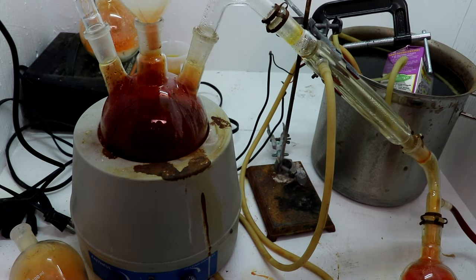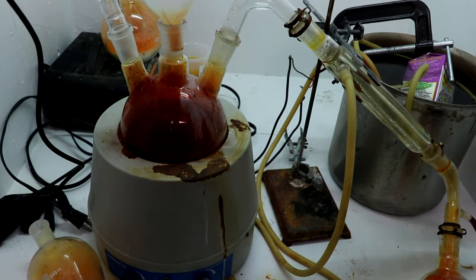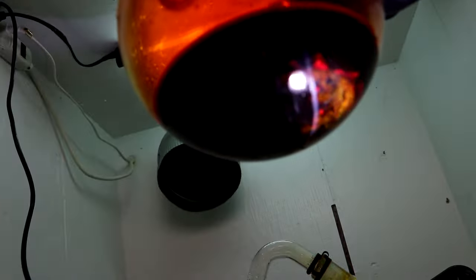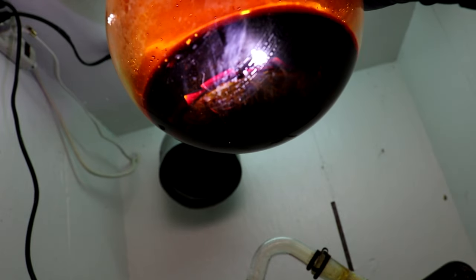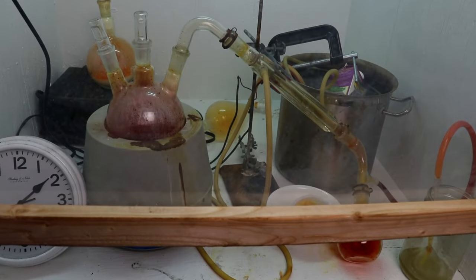Can't really see what's going on. Not bubbling or frothing or anything. It shouldn't make any gas. It's another bonus of this process. Let's pick this up so we can see what it looks like from underneath. Yeah, you can see the liquid bromine in there, sitting down on the gold. Okay, presumably the gold's in there being dissolved.